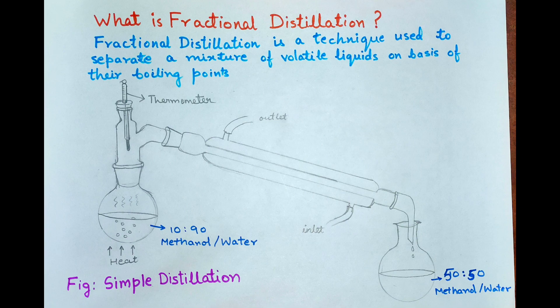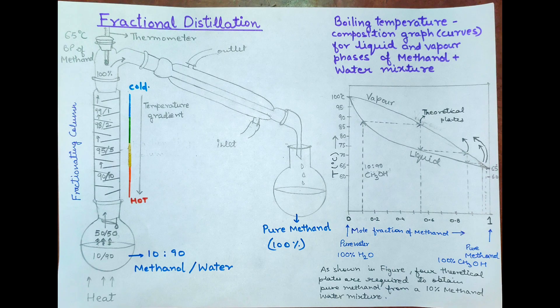We will have a mixture of 50% methanol. To obtain pure methanol, we have to distill again and again until we get 100% methanol. So to simplify this, we can use a fractionating column instead of distilling again and again.